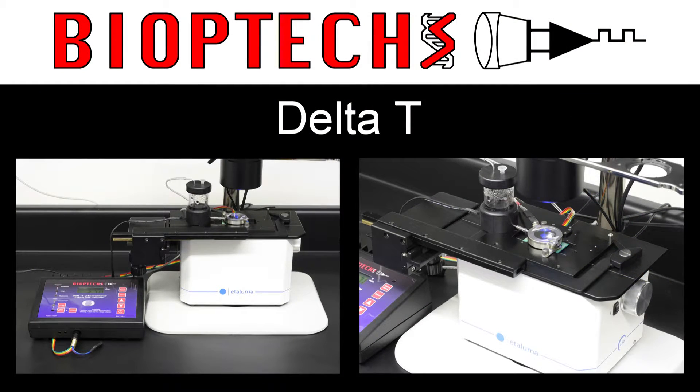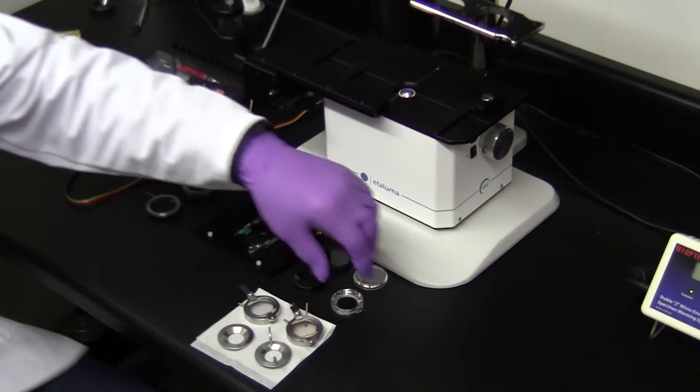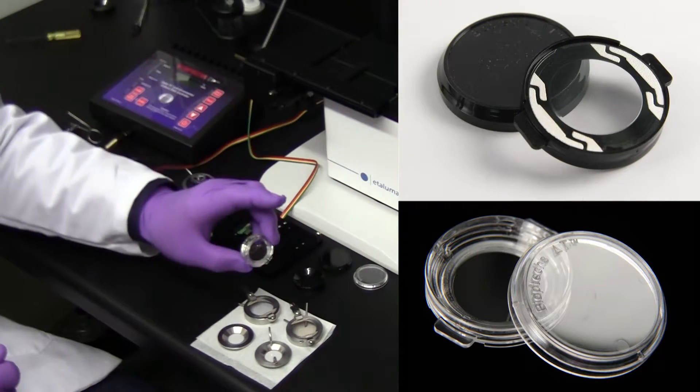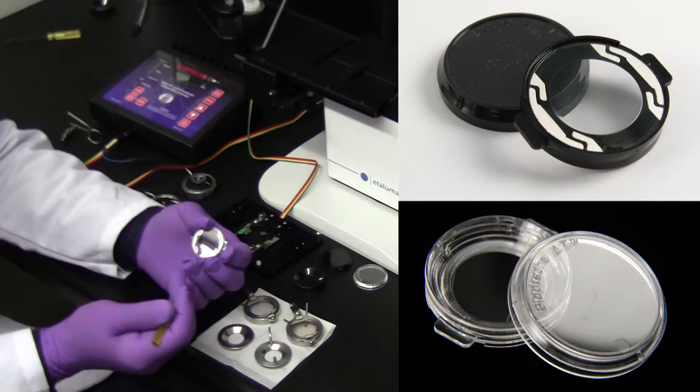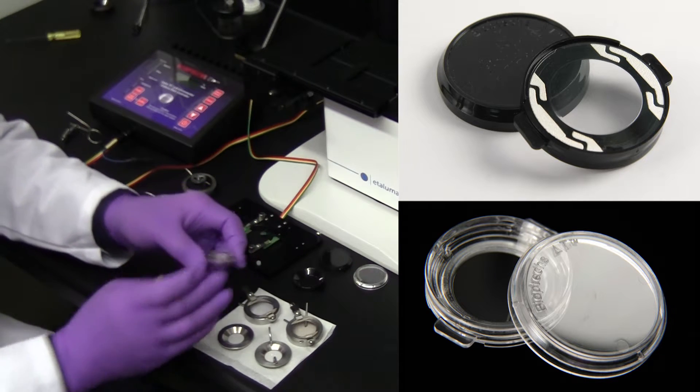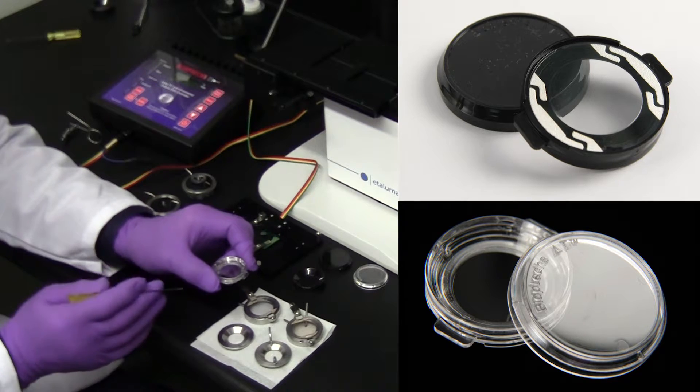Here we have a Delta-T system on an Etaluma microscope. The Delta-T is based on a 35mm coverslip bottom culture dish having integrated temperature control. The bottom surface of the coverslip is coated with indium tin oxide and a special geometry of conductive bus bars.